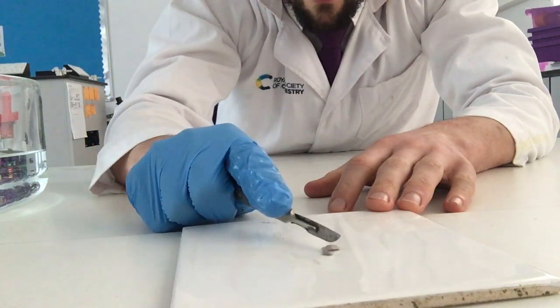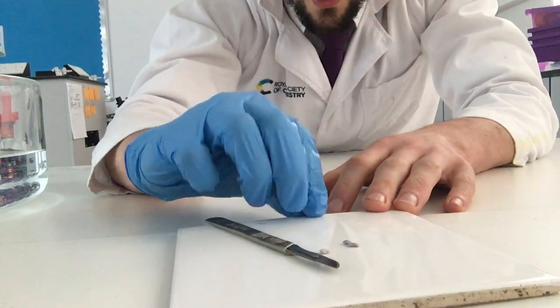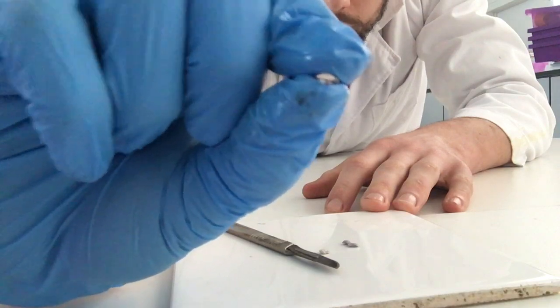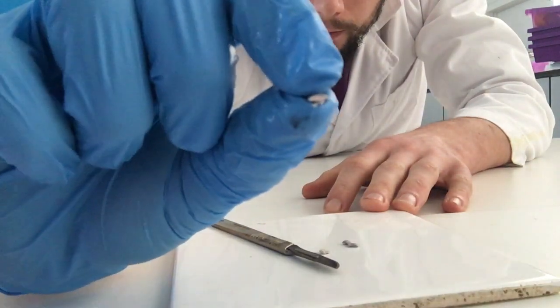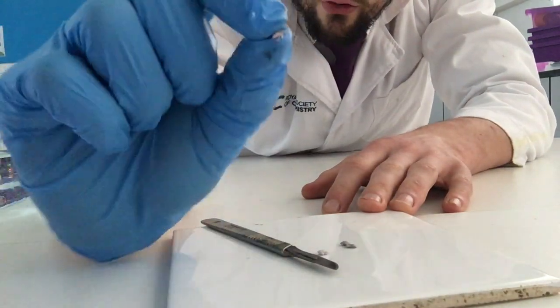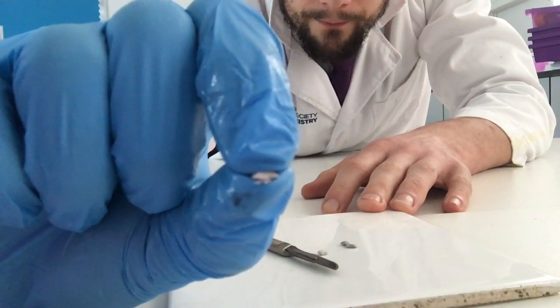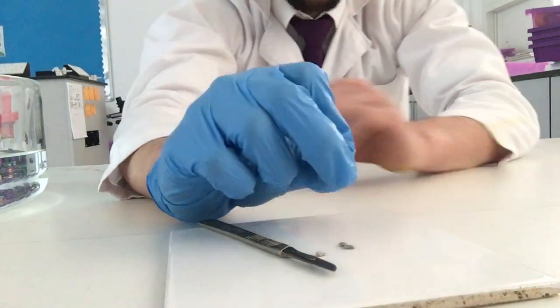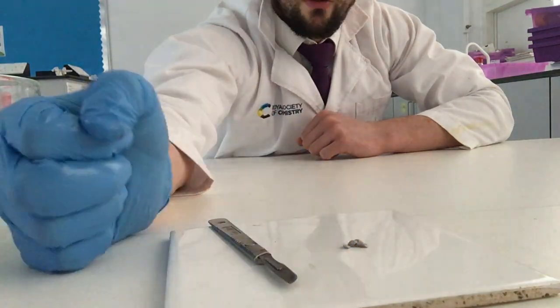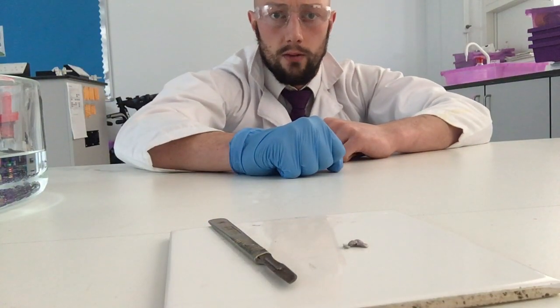I'm going to cut a fresh surface on it, and we should see, if I now show you my fresh surface, it's a lot shinier. There you go, I hope you can see that shiny. It's hard for me to show you much more than that. But where I've cut it, it's shiny, but it's already starting to go the same dull grey that we saw before. So it's very quickly reacting with oxygen in the air to make a metal oxide. Metal plus oxygen is going to make a metal oxide. So that's one chemical property of the alkali metals, that they react very easily with the air.